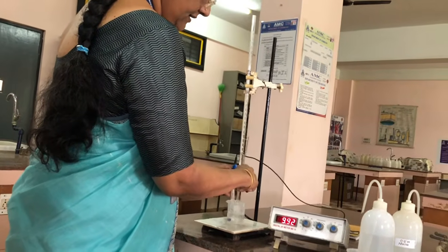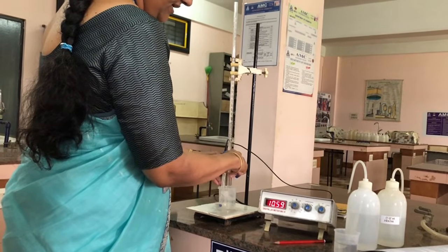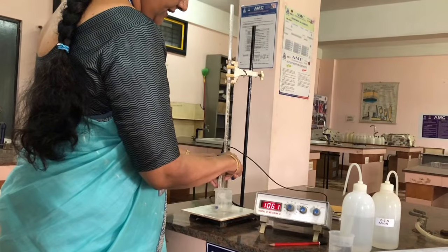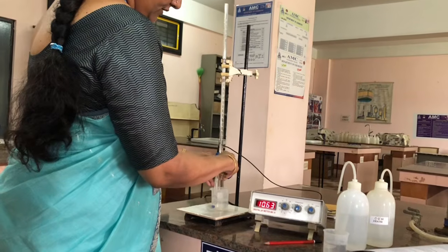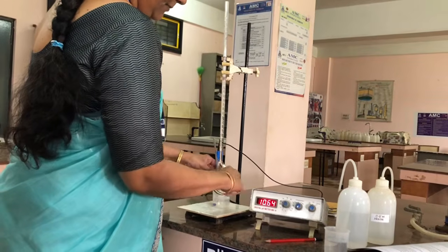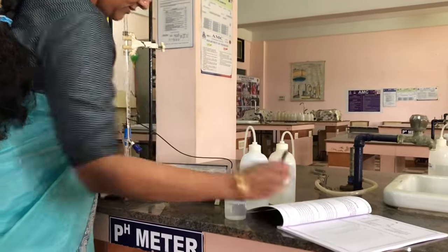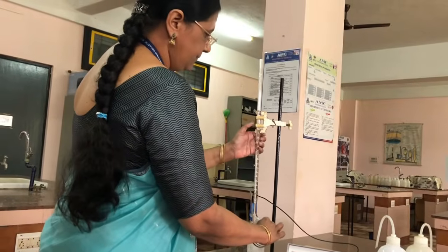9.8, 10. So it is further increasing. We have to note down a constant reading. See that the reaction is completed. So now it is showing 10.64. Now we have to add, now the reaction is completed.